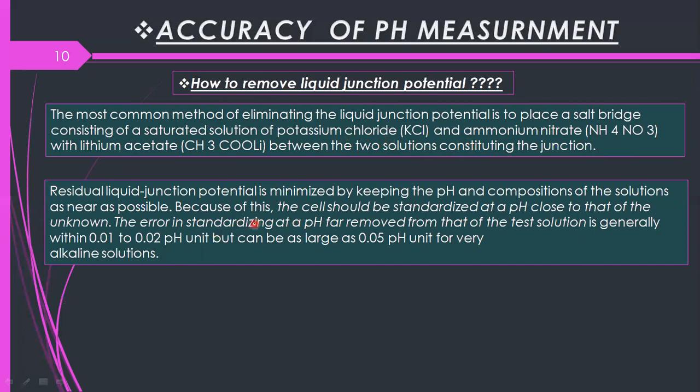And the second method is to keep the pH and composition of the solutions as near as possible, because it is created due to the difference in the composition and the pH of the solutions. So we will try to keep their composition and pH as near as possible.